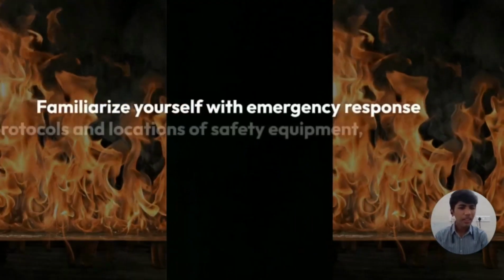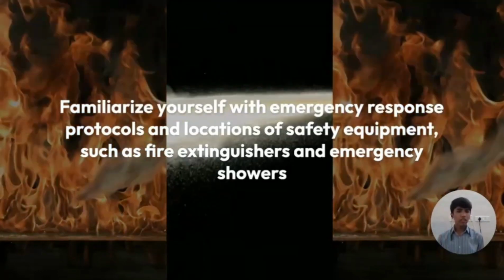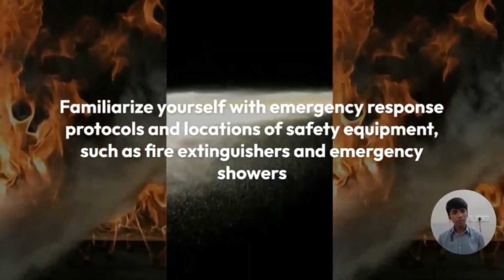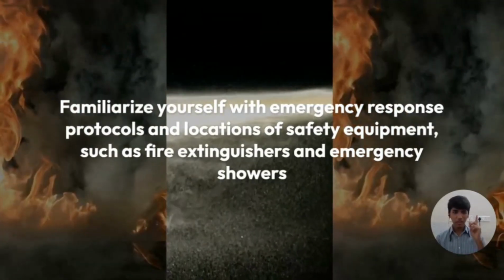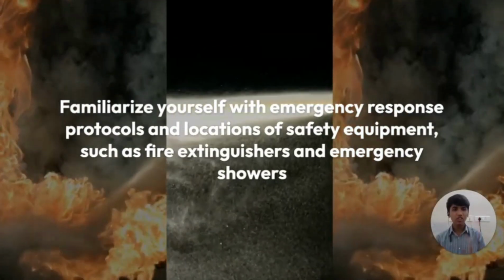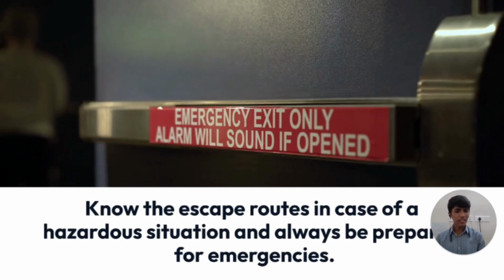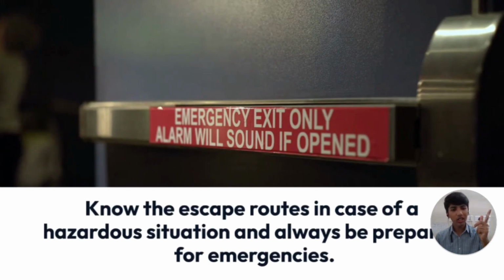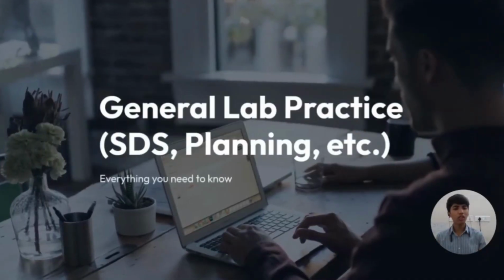Now let's talk about emergency and accidents. You should be familiarized with the lab so that if there is some mishap, you can save yourself. So you should know emergency exits, emergency numbers, emergency showers, and also know what to do in an emergency situation. Know the escape routes in case of a hazardous situation, and always be prepared for emergencies since it is a live hands-on experience. You don't know what will happen.